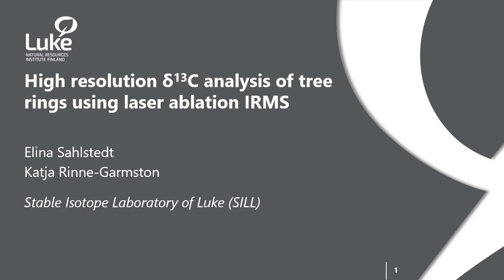I will start this presentation with some background information on stable isotope analysis and analysis of tree rings specifically. I will shortly introduce the operational principle of the instrument and describe how the laser ablation IRMS compares with conventional analytical methods. After this, Katja will take over and talk more about how we have utilized this analysis method on different research questions.